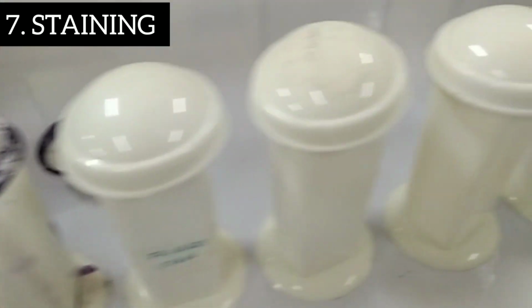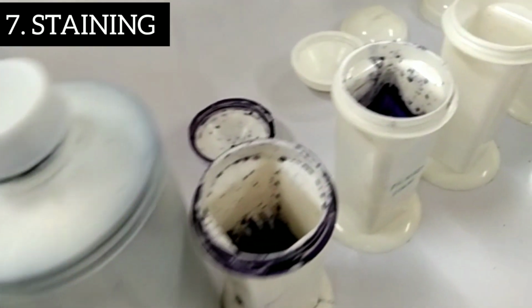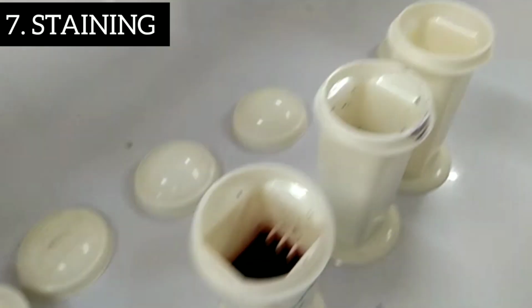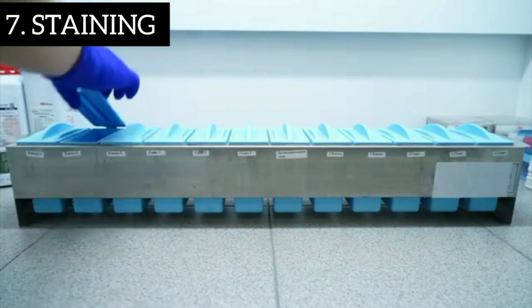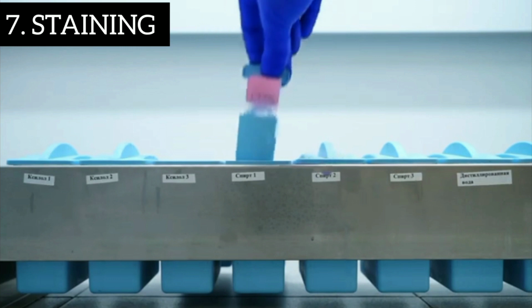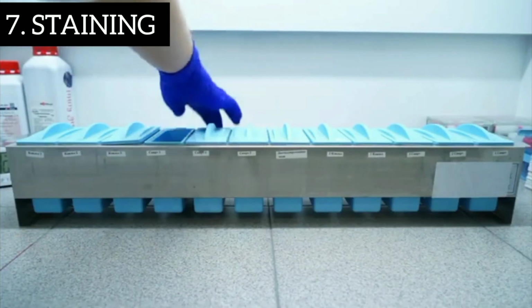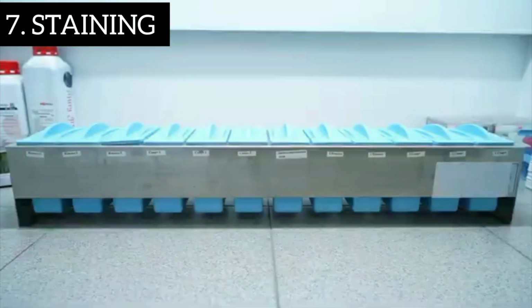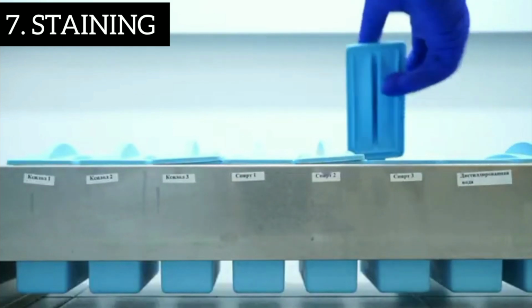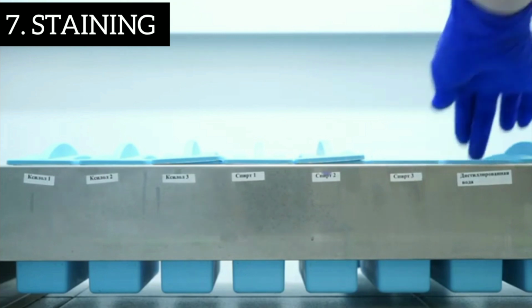And now, the next step is staining. Staining is the process of coloring the transparent tissue sections for the purpose of optically differentiating the cells and tissue constituents of the specimen microscopically. In routine staining procedures, it is important to reverse the embedding process and make sure that the tissue on the slide becomes permeable to water-soluble dyes. The reversal process includes deparaffinization with the use of clearing agents and rehydration with the use of descending grades of alcohol in 1 to 5 minutes on each.